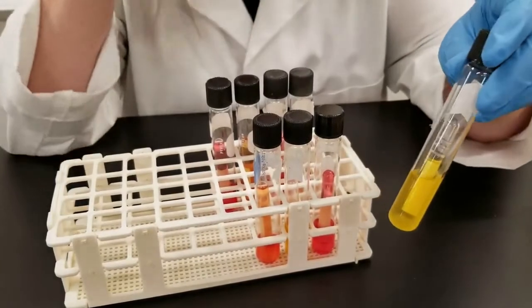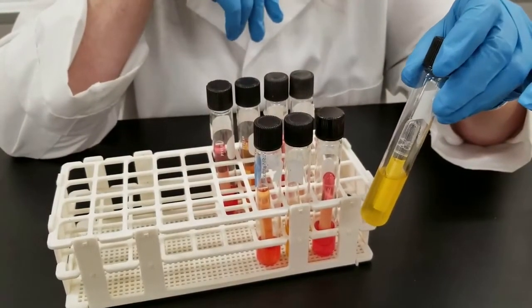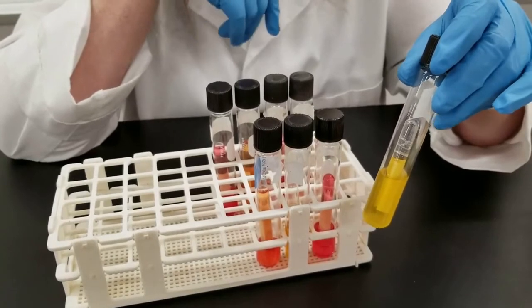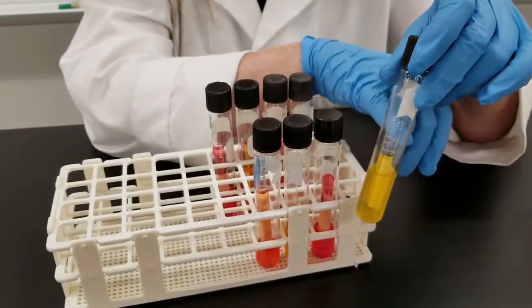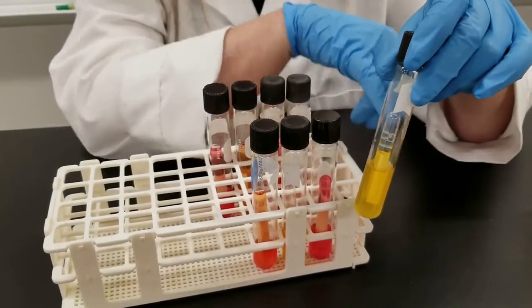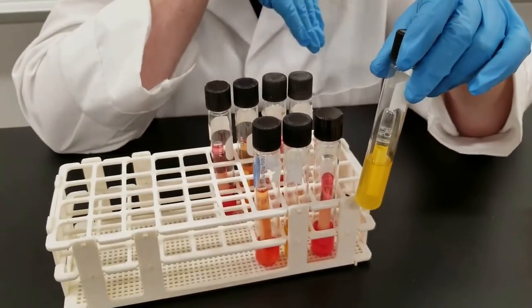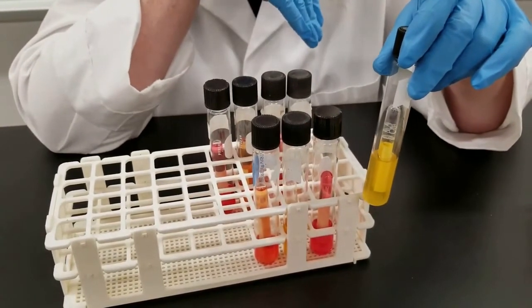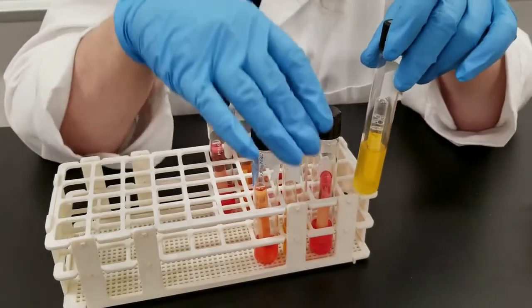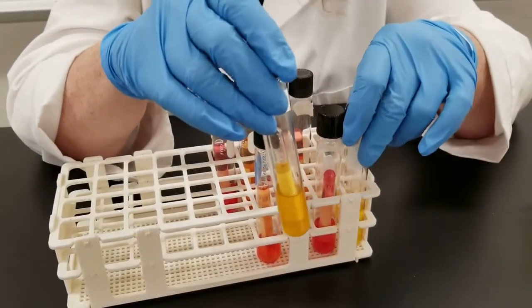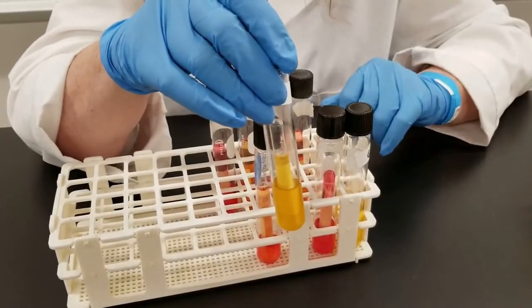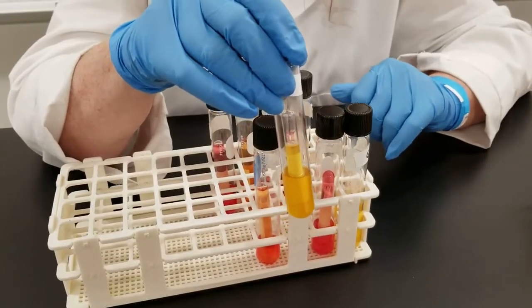In this tube, you can definitely tell, it has turned yellow, that would be positive for acid. And then if you look at the inverted tube, you can see there's an air bubble in there. So that is positive for gas. So you would record that as A/G or acid and gas. This tube here would also be recorded as acid plus gas production.